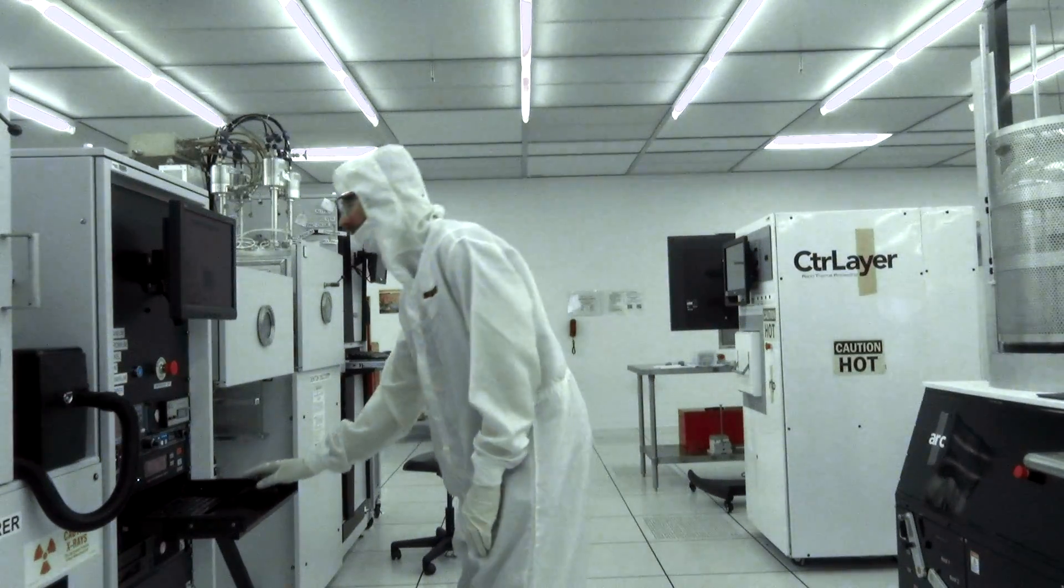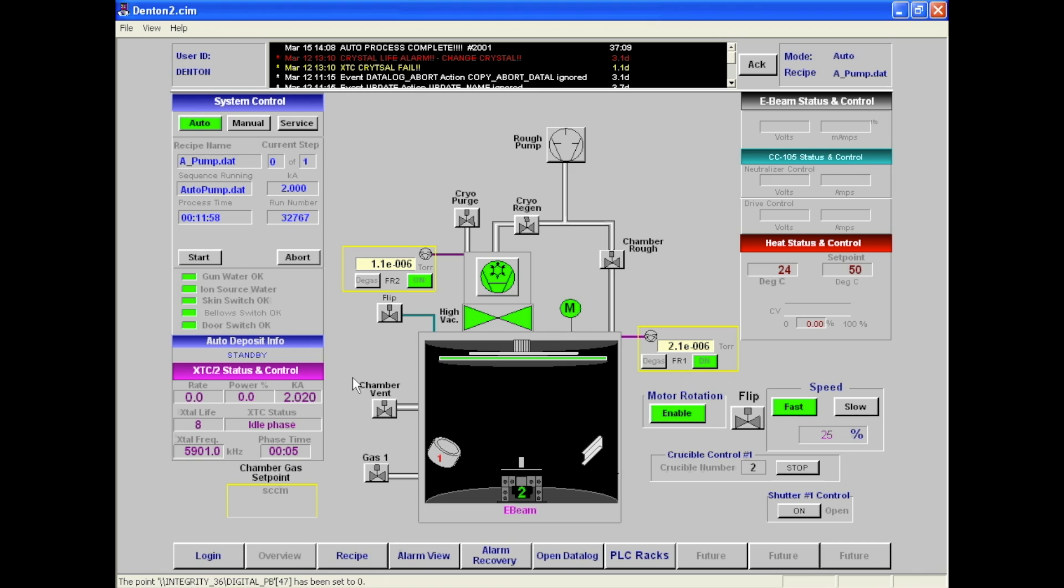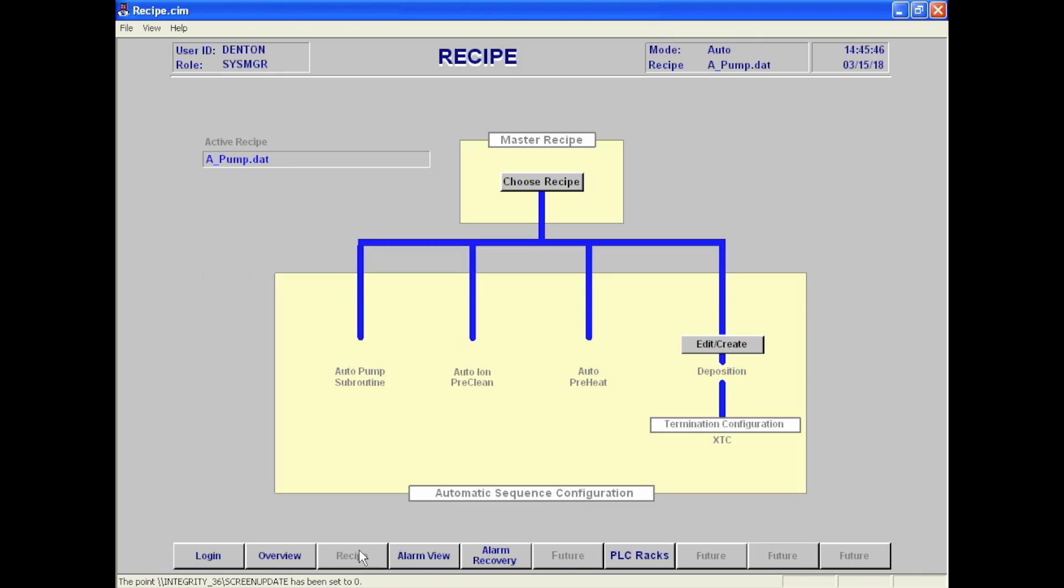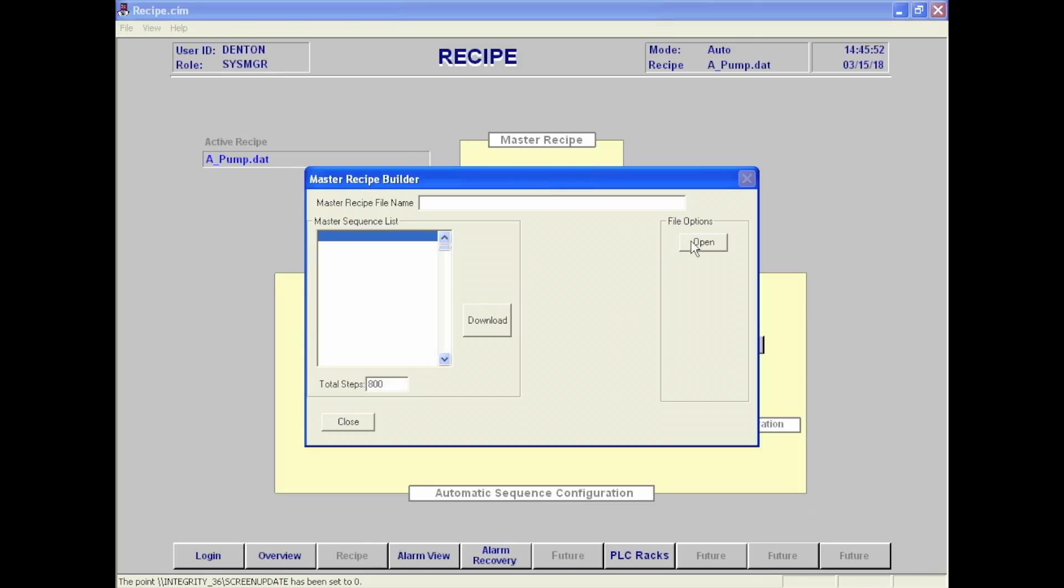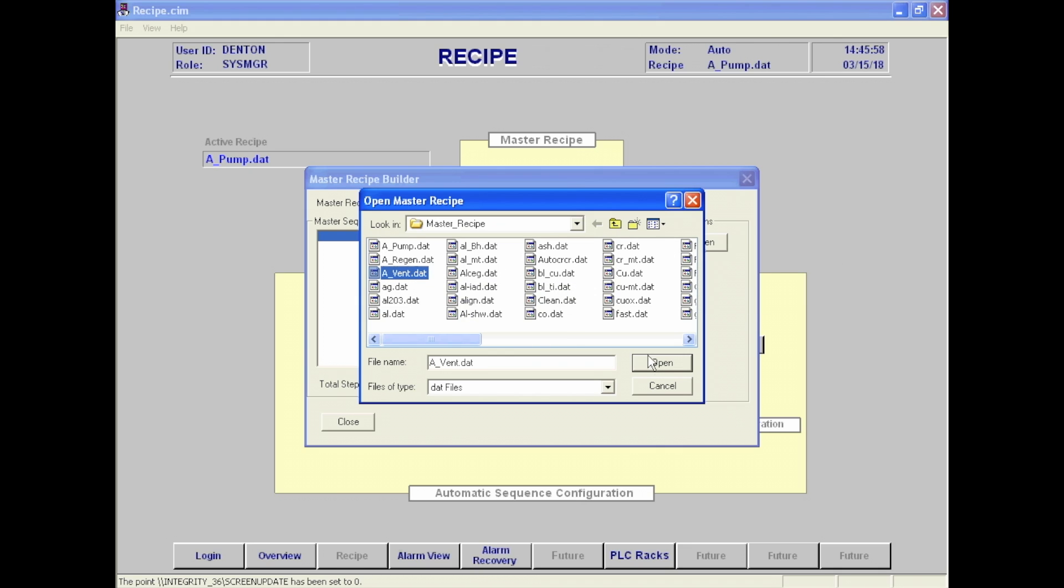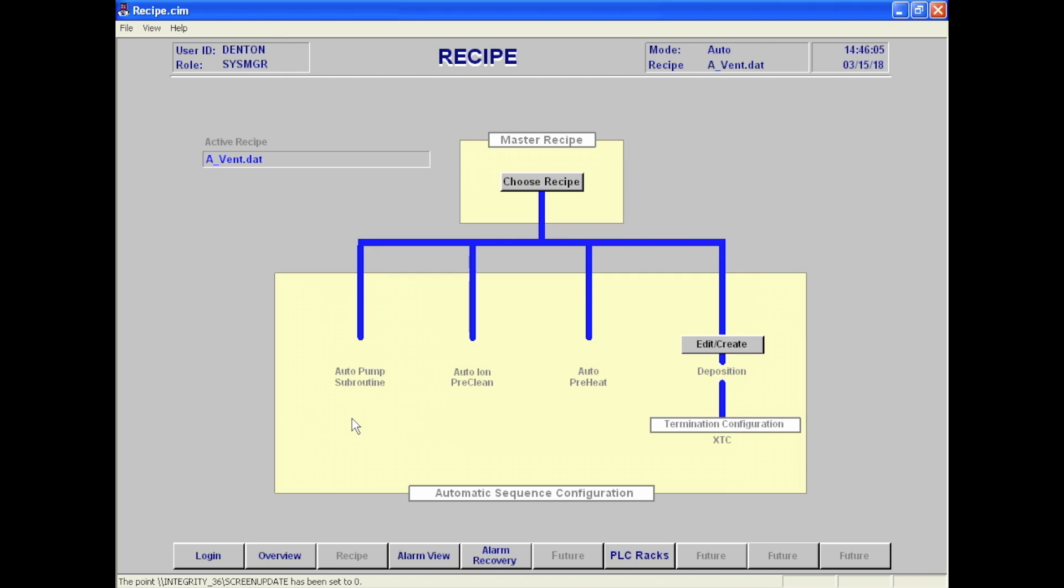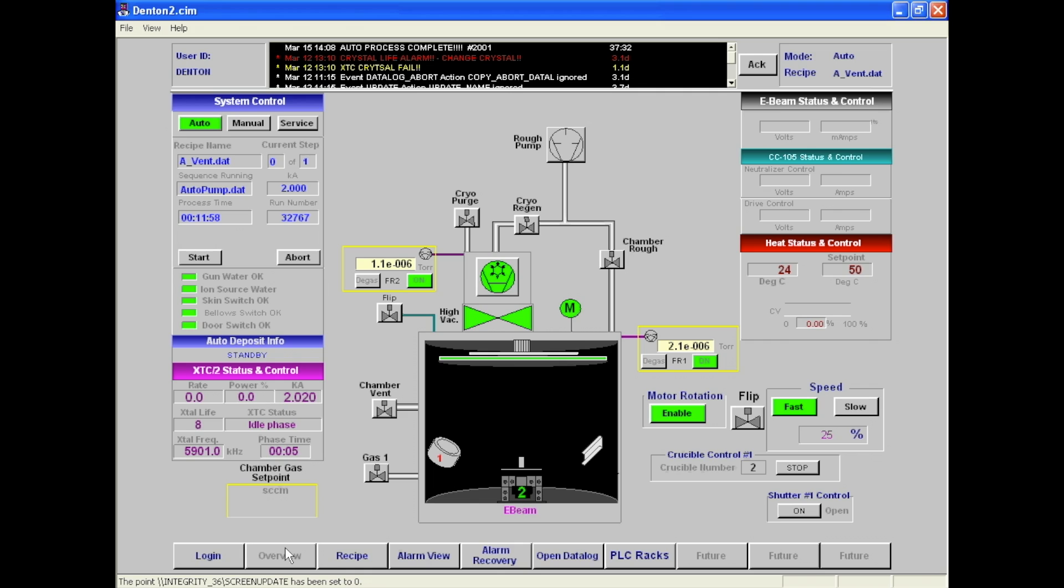To begin loading a sample, click recipe on the overview screen. Then click master recipe and open. Open avent.dat file and click download to download the recipe to vent the chamber. If the file name appears under active recipe, click close.